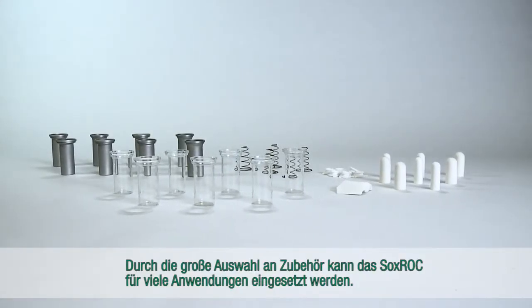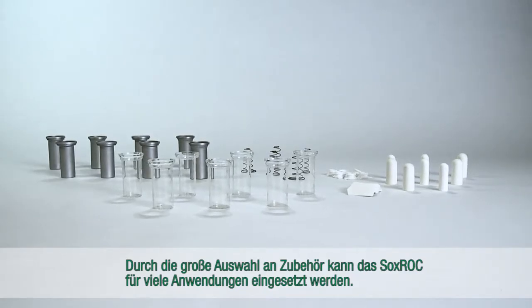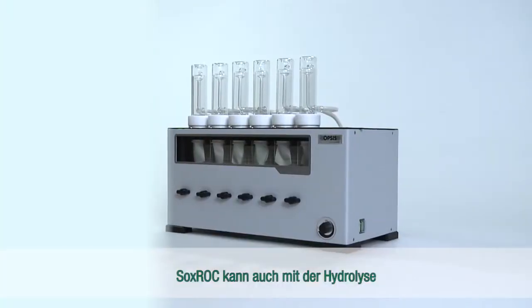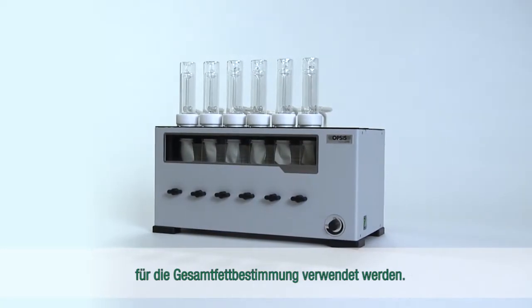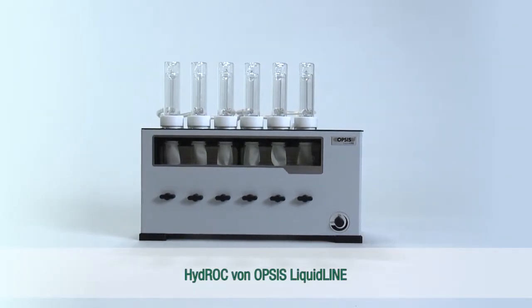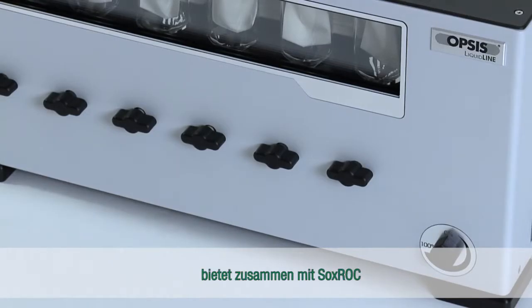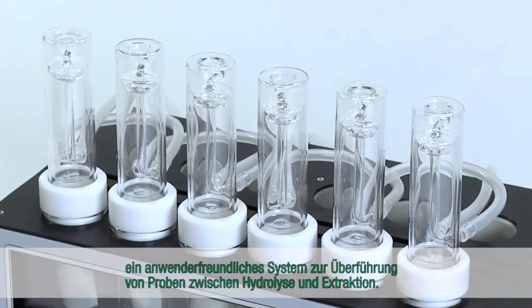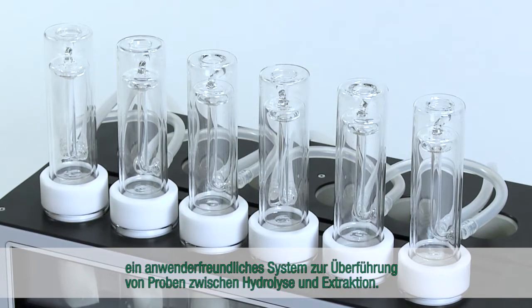Due to the wide selection of accessories, the SoxROC can be used with many applications. SoxROC can also be used with hydrolysis for total fat determination. HydROC from OPSIS LiquidLINE together with SoxROC offers a user-friendly system for transferring samples between hydrolysis and extraction.